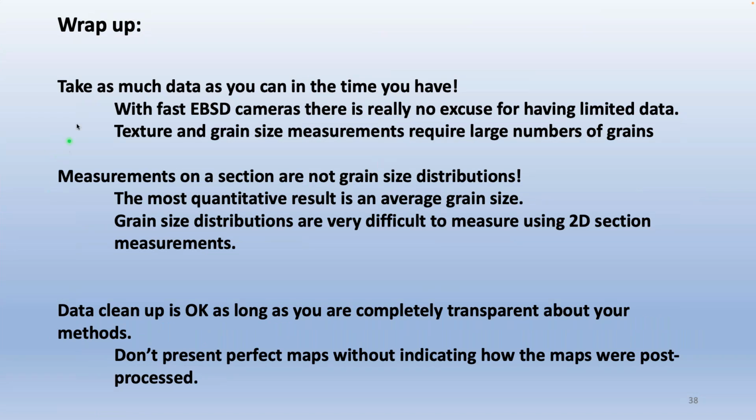So I'll wrap up now. I think that's probably enough of me telling you what I think. First thing is take as much data as you can in the time you have, right? So if you have the SEM overnight, you might as well use it all night. With fast EBSD cameras, there's really no excuse for having limited data these days.